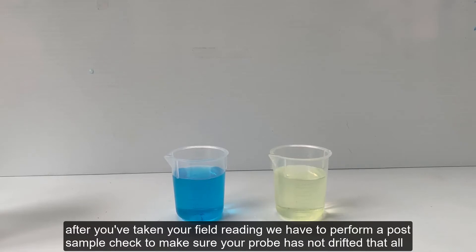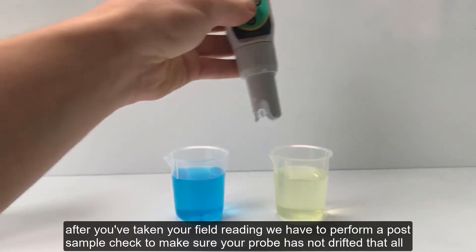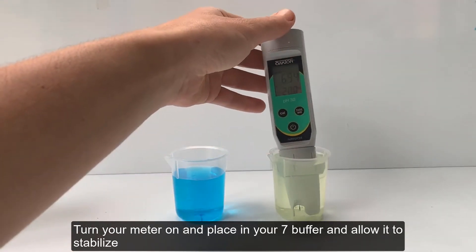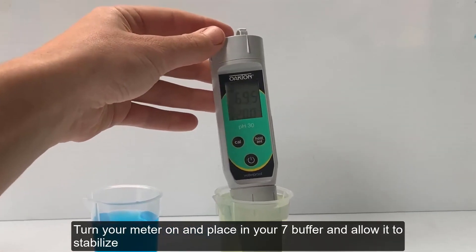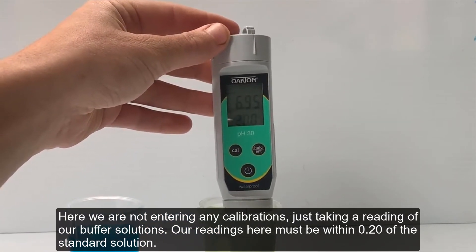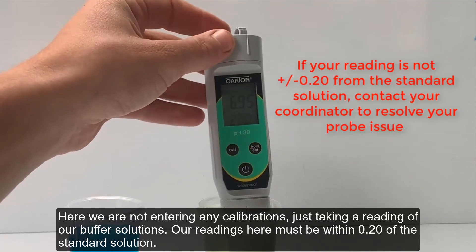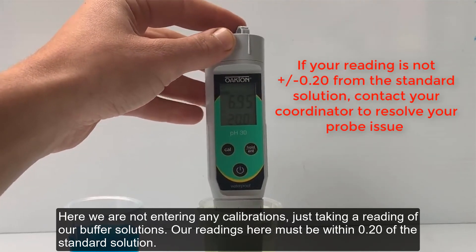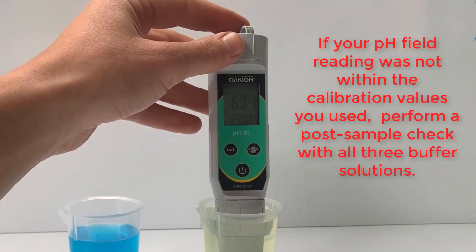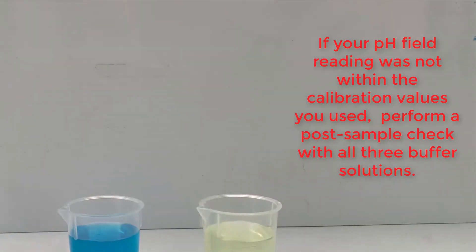After you have taken your field reading, we have to perform a post-sample check to make sure your probe has not drifted at all. Turn your meter on and place it in your 7 buffer and allow it to stabilize. Here we're not entering any calibrations, just taking a reading of our buffer solutions. Our readings here must be within two-tenths of the standard solution. If your pH field reading was not within the calibration values you used, perform a post-sample check with all three buffer solutions.